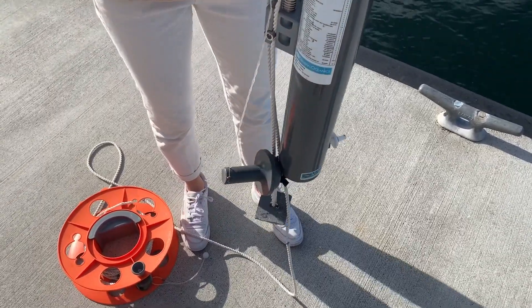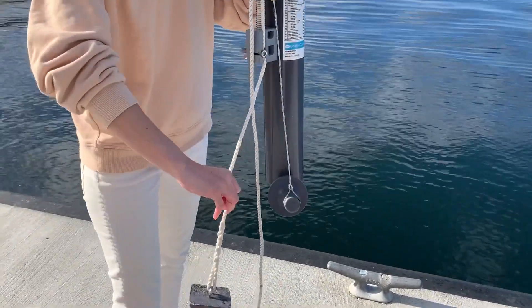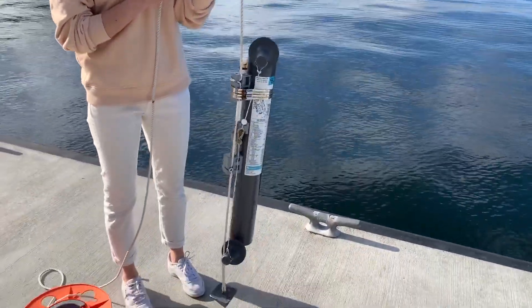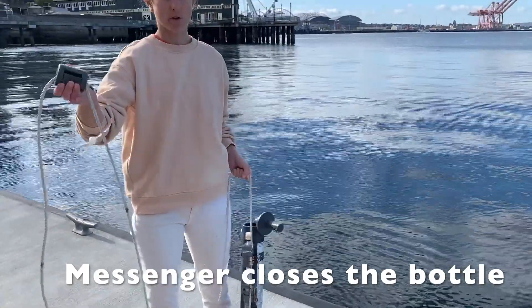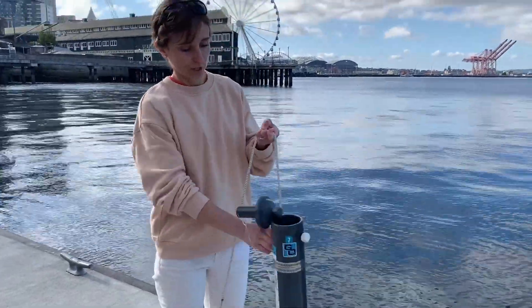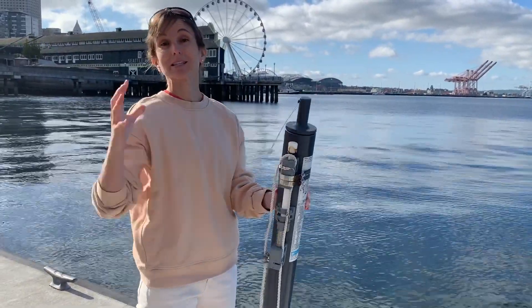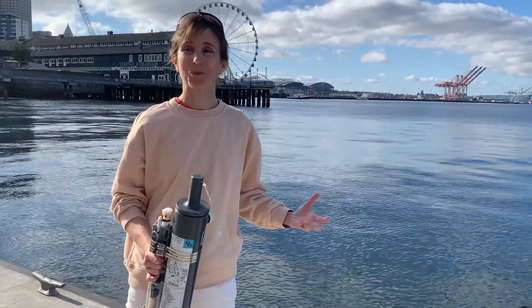Before I send this down I want to show you how it closes. When we send the bottle into the water, the water is going to flow through that tube until we actually close it. When I close it, I'm going to lower it down on the line, and when it gets to five meters I'm going to send down the messenger — this heavyweight here — and as the messenger falls down the line it will get to this spring-loaded rod, hit this plunger, and close the bottle. When it closes it's going to trap the water that we want, and then we'll be able to pull it up and drain it out and measure whatever we want to measure.